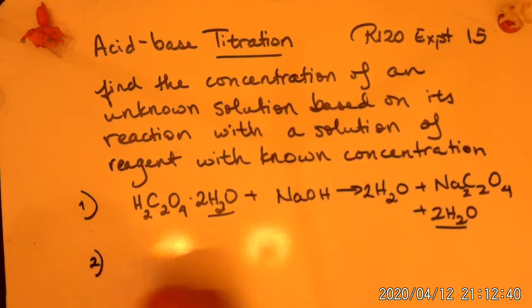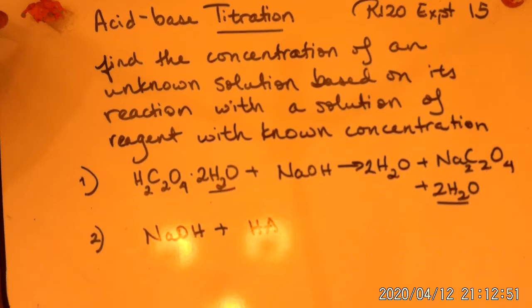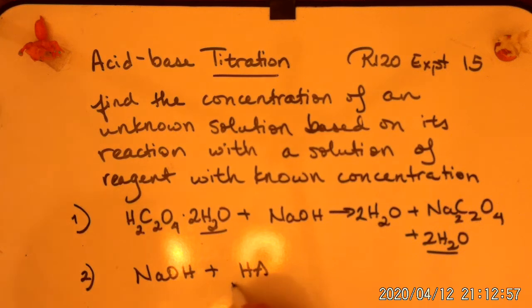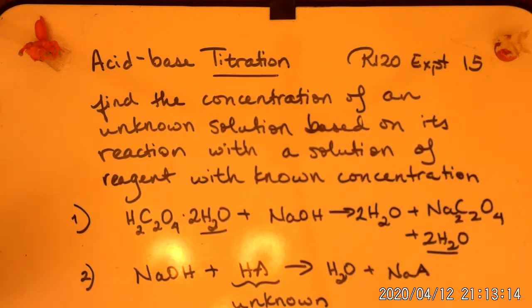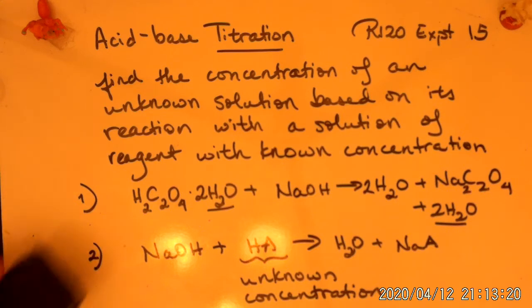And your second reaction is you're going to take your sodium hydroxide solution and react it with an unknown acid. Okay, so that acid here is of unknown concentration. And again, you're going to form water and then your salt.